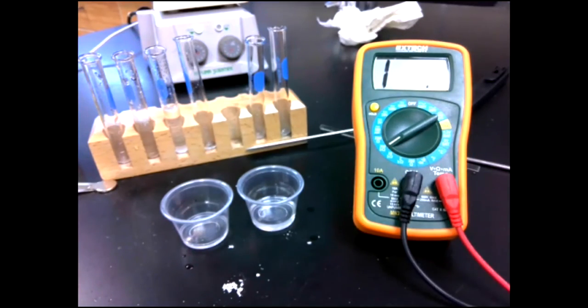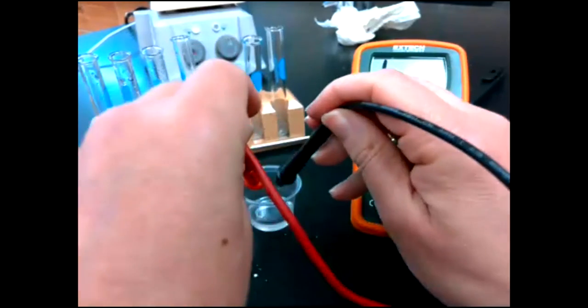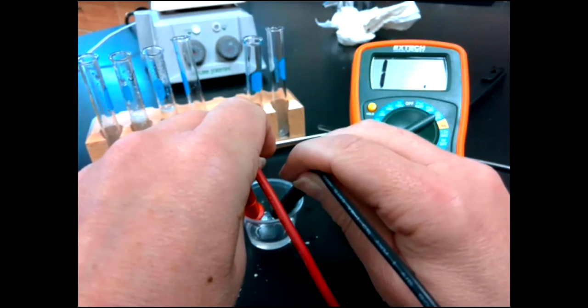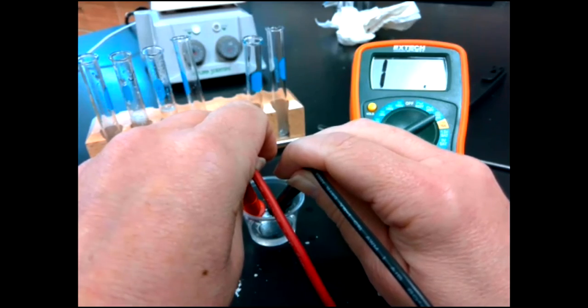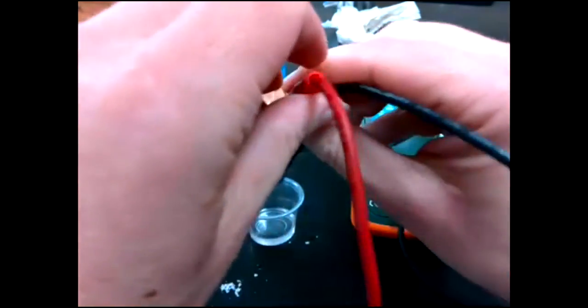And so now I wiped it off, and now we're going to put both probes in. This is B in hexane. Can you see the number? And nothing's happening, absolutely nothing. No conductivity, no nothing. So it's not moving at all. So B does not conduct.